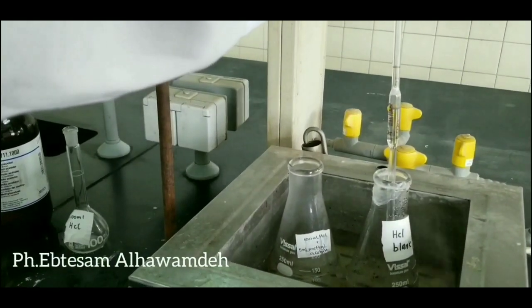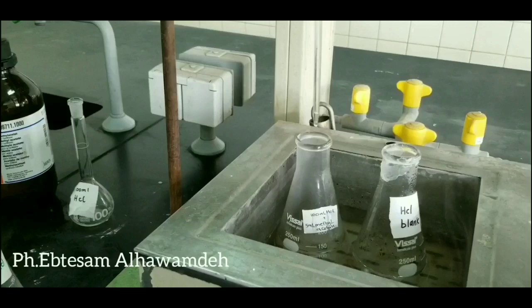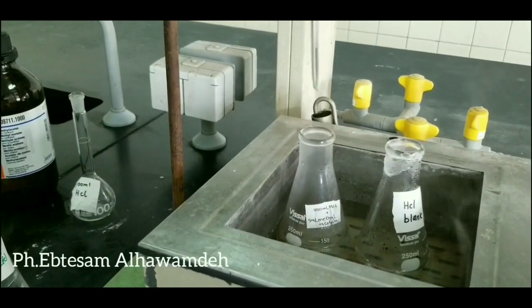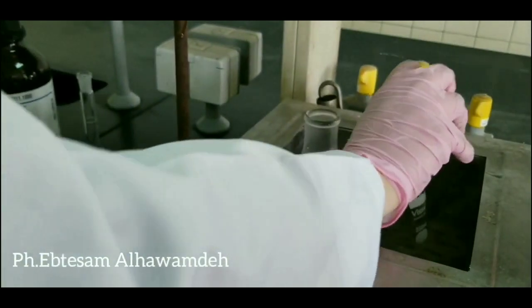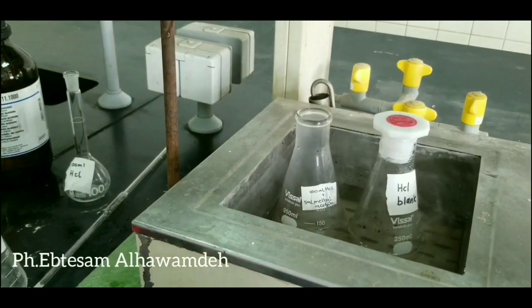Drain this sample into a flask containing about 75 ml of ice water and 5 drops of phenolphthalein as indicator.